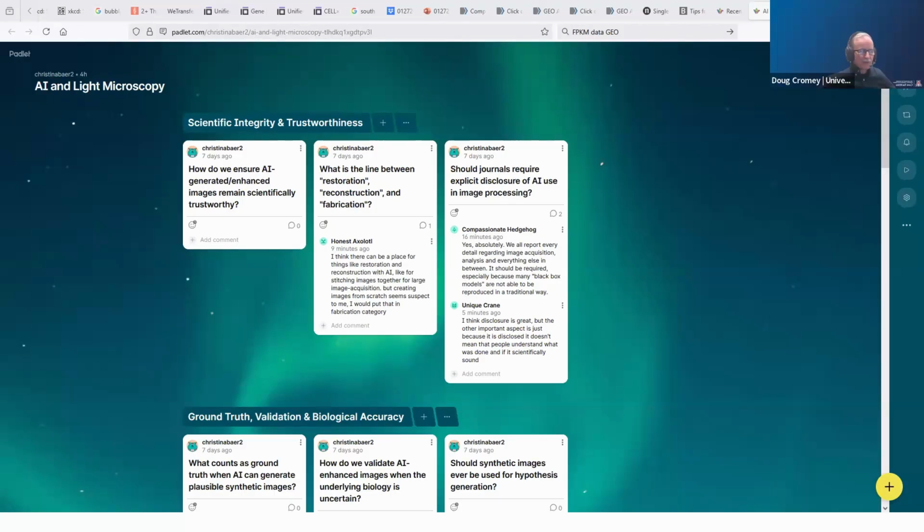Well, for image analysis, some of the segmentation stuff that AI can do that was always difficult in the past is amazing. I have a friend here at the university who's constantly harping on the fact that there needs to be a human in the loop.